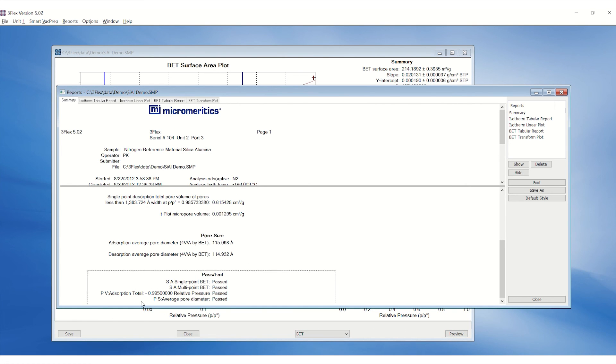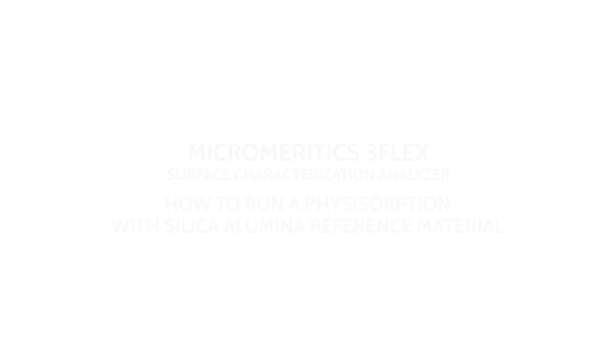Scroll down on the Summary page and the report will indicate whether the results pass the specifications or not.